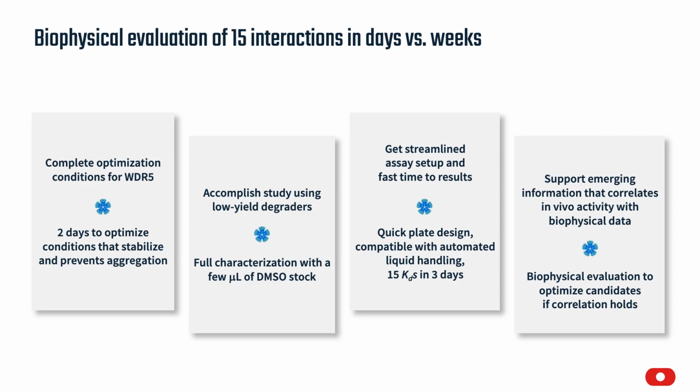And to conclude, I will leave you with the following take-home messages. So first and foremost, we completed this biophysical evaluation of 15 different interactions, where 5 of those were ternary complex formations, in days rather than weeks. That included the complete optimization for WDR5 to find suitable buffer conditions for both labeling and running our assays. And we accomplished this study regardless of the limitations that were presented by relatively insoluble degrader molecules that were produced in rather low yield.